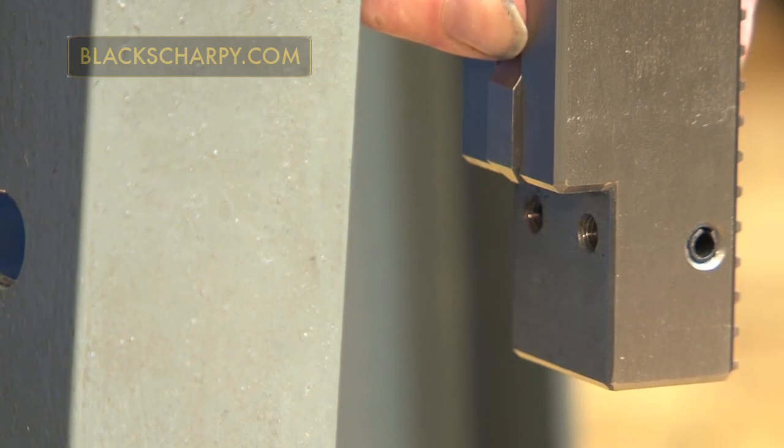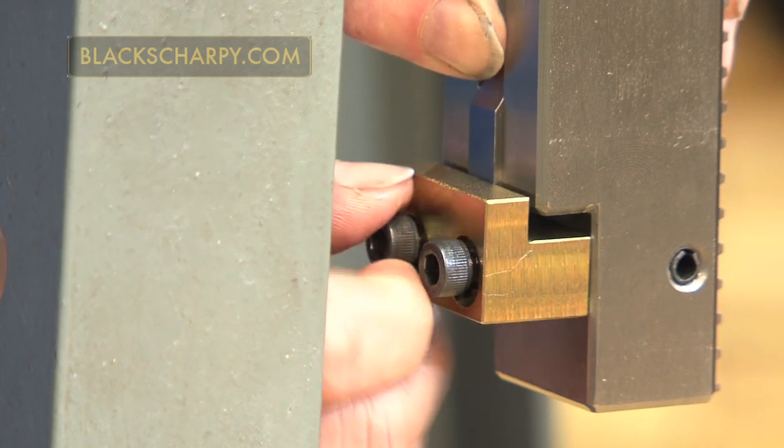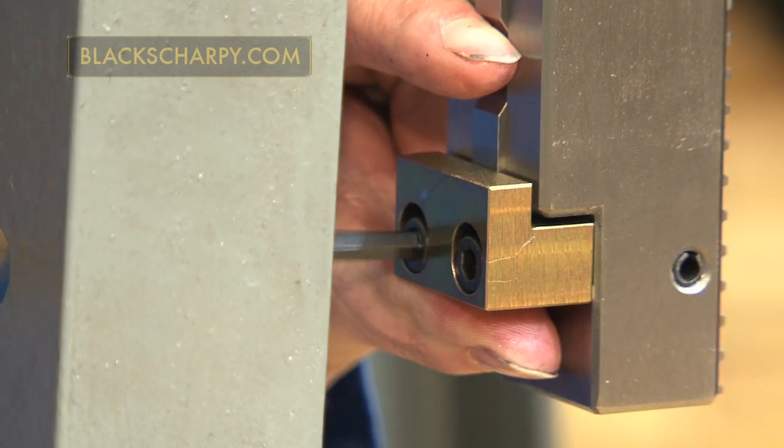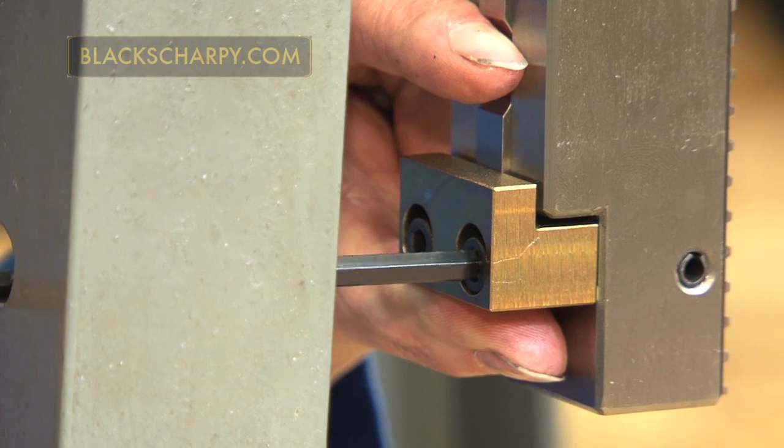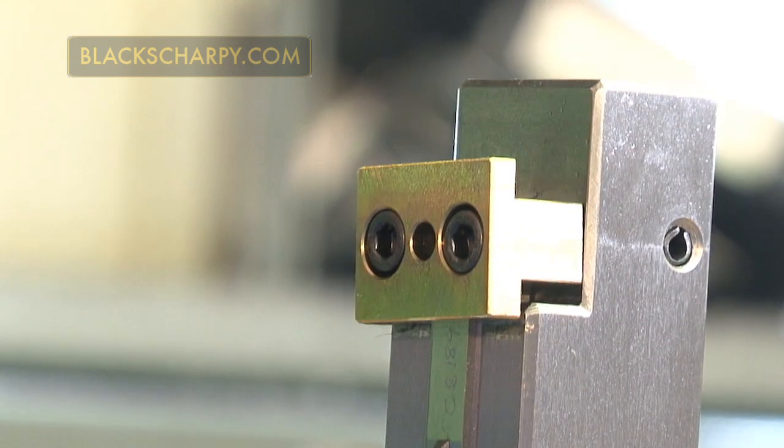Retaining the upwards pressure on the broach, refit the bottom clamp and tighten the clamping screws. With the rack in the raised position, insert the pin and tighten the top clamp retaining screws.